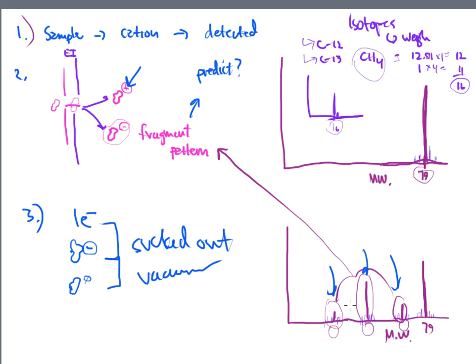So when we eventually get to the point where we're analyzing mass spectra and figuring out what fragments are leading to what peaks and positive signals, then we will have a clear understanding of what we're looking at. All right? So that's the concept of fragmentation. We are going to see major peaks, not just one, but multiple ones, show up on the spectrum. And then beside those major ones, we're going to see tiny little bitty ones. And those tiny ones are coming from the isotopes that could be present in that compound. They're naturally there. We cannot get rid of them.